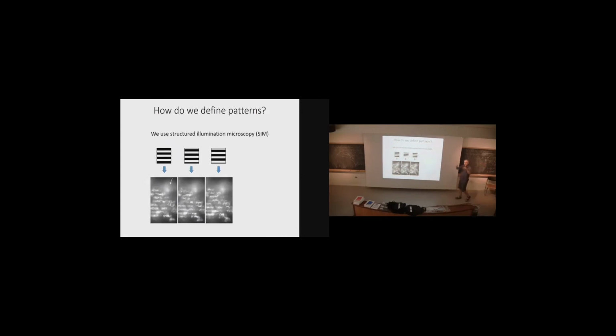Of course, I need to know where those neurons are that are in focus, right? So it's kind of like random access scanning. I need to know what's in focus at every depth. So I need a pre-calibration step, and at every depth I have to figure out what's in focus. And there are standard ways to do that with microscopes. There's this technique called structured illumination microscopy, where you illuminate your sample with grid patterns, and then you move the grid around.